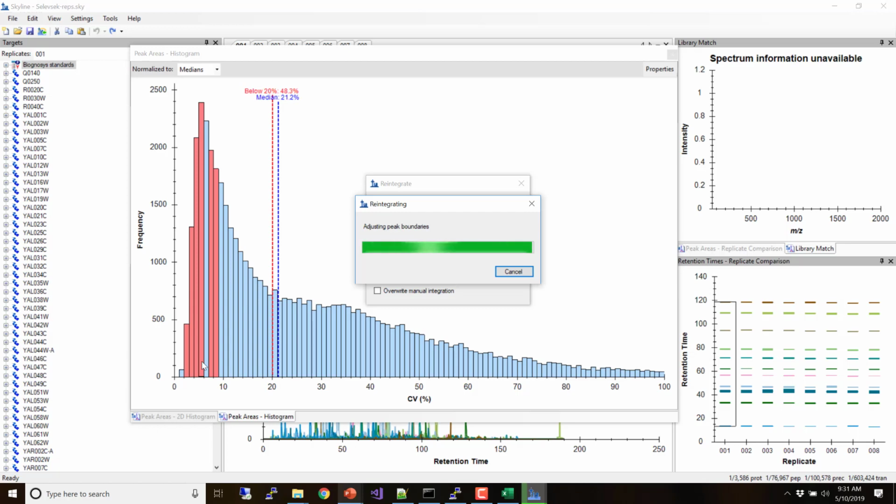Use the statistics, come up with some interesting things, and then go double, triple check them, and maybe then do a validation experiment on PRM or SRM. When you're at this statistical level, I would use the statistics to identify things to look at in this file, and Skyline will allow you to look at them. You've got 100,000, well, that's 50,000 precursors.